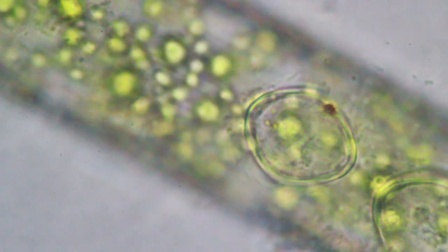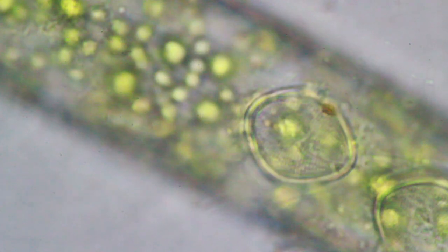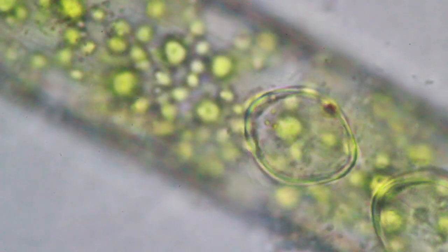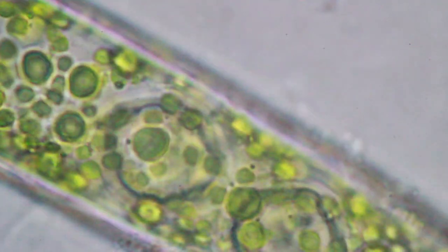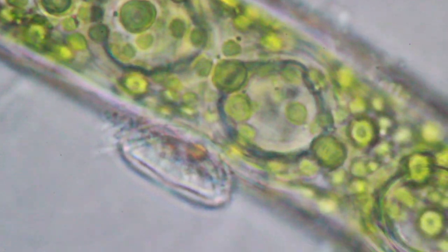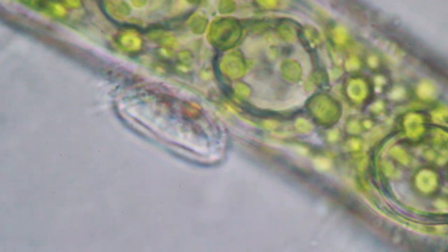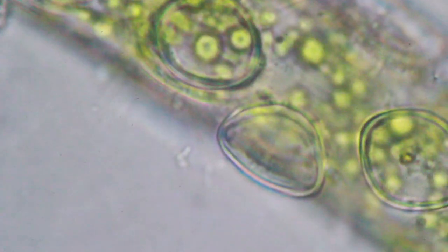These are round things here, these seem to be diatoms growing on the algae. I know that these are, or I think these are diatoms, because you can see actually the structure of the shell. If you focus back and forth carefully, you can actually see the texture of the shell a little bit, which is typical for diatoms.